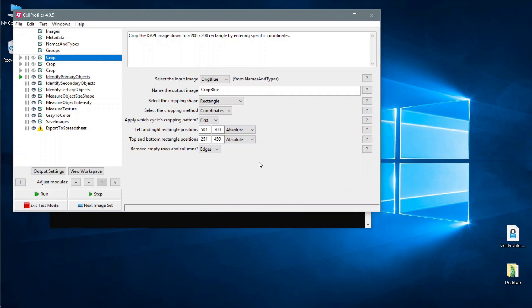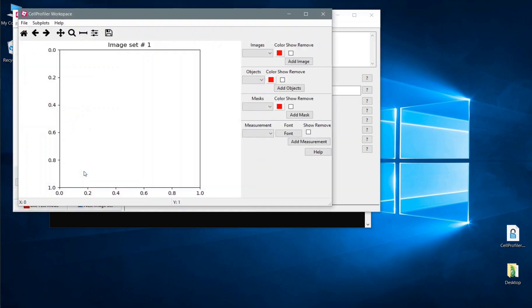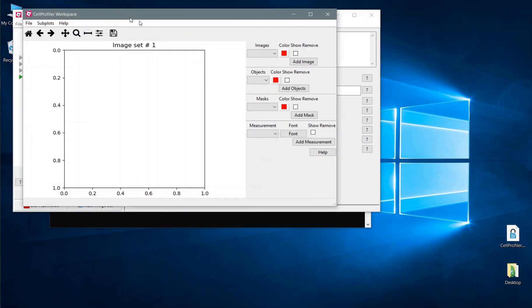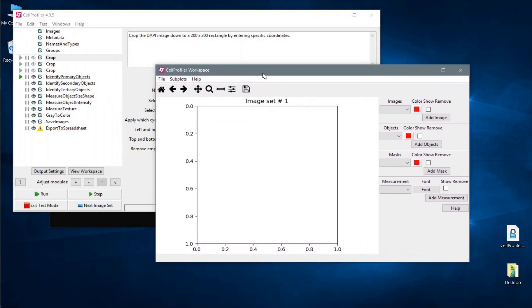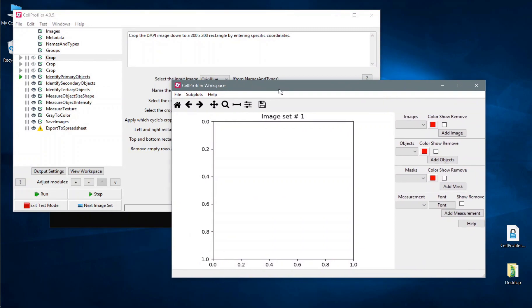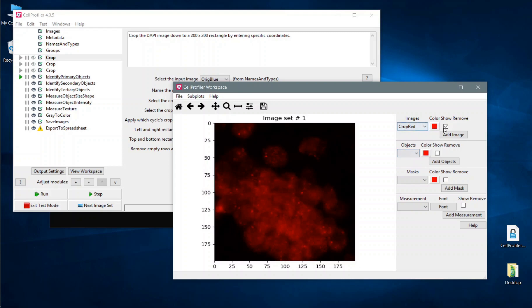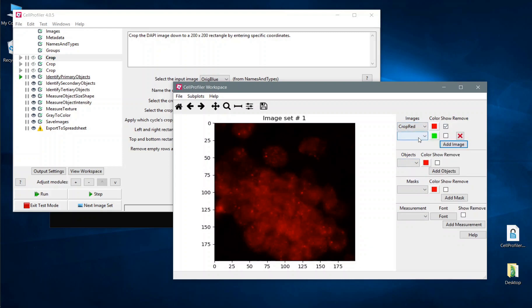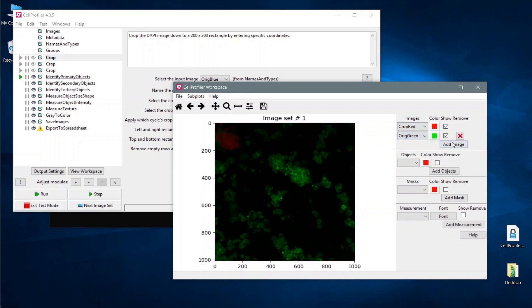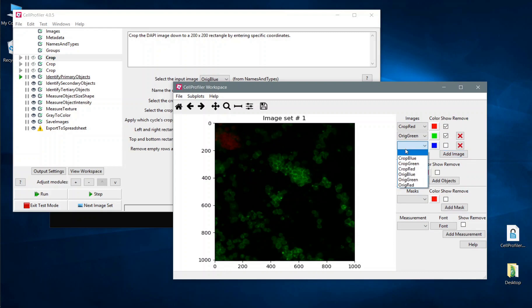Another button that's been added to the main window is this view workspace button here. This opens a tool which was previously in CellProfiler called the workspace viewer. The workspace view is particularly useful because it allows you to build a customized view of your particular image set and data and detections. So if we add the red image, green image, and blue image, you can see we're effectively building a custom image up here.